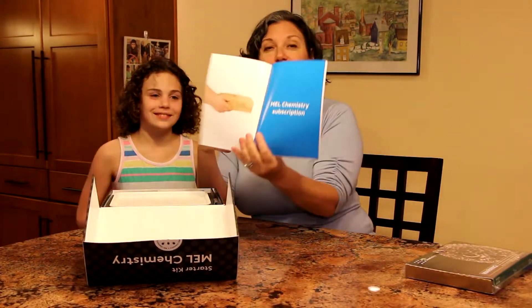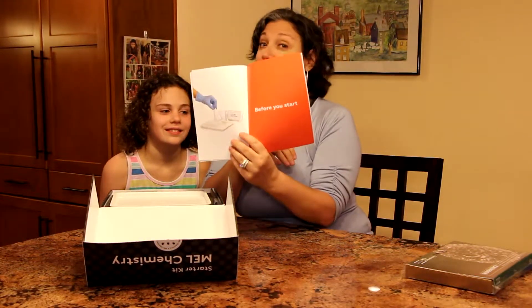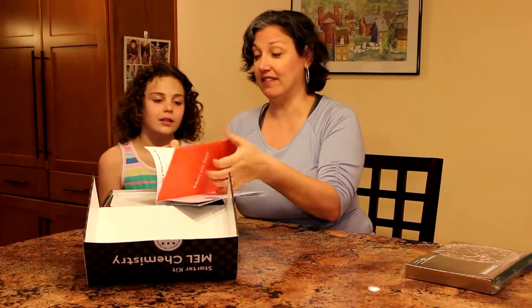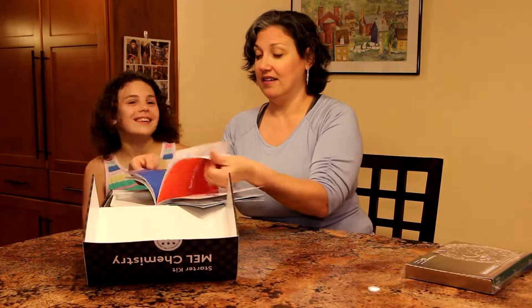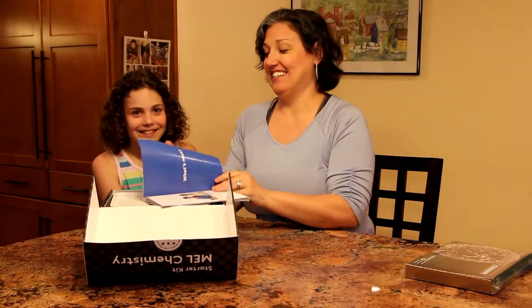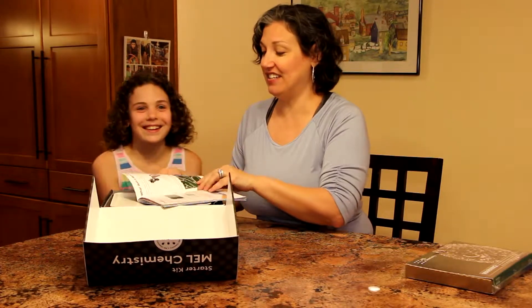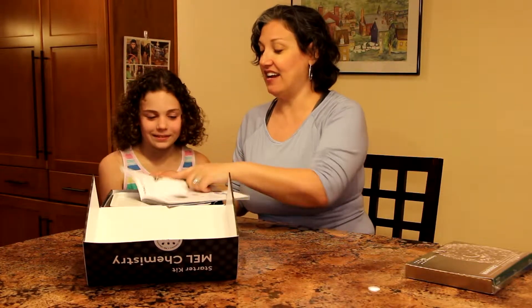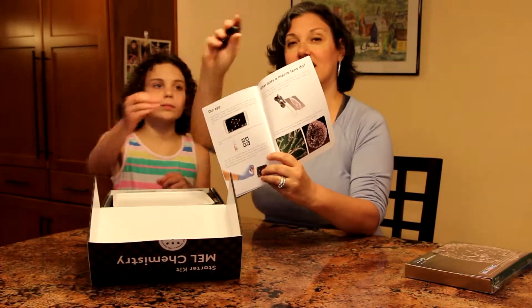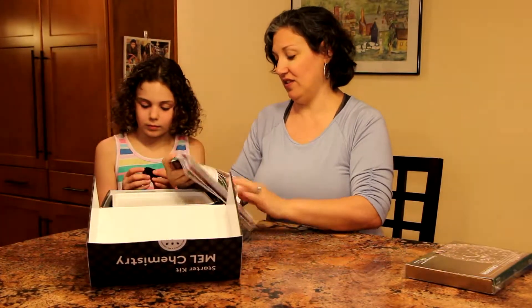They go over a subscription to MEL Chemistry. Before you start, so before we do an experiment we'll have to look at that. And then it has some information in here about — you see that? I told you that was for your phone. The macro lens. That's this little piece here, so you can look at things closer. That's really cool.